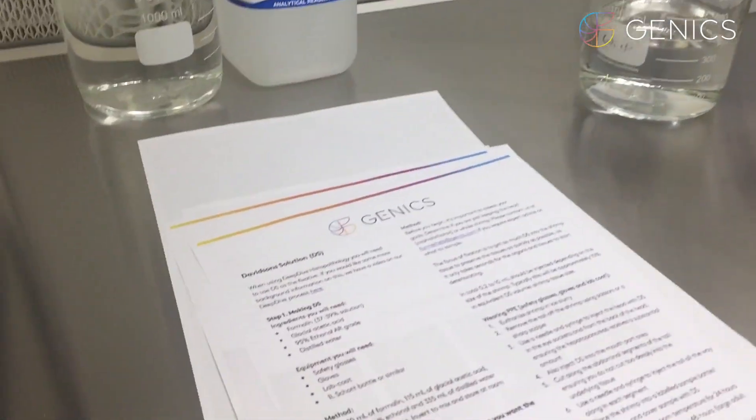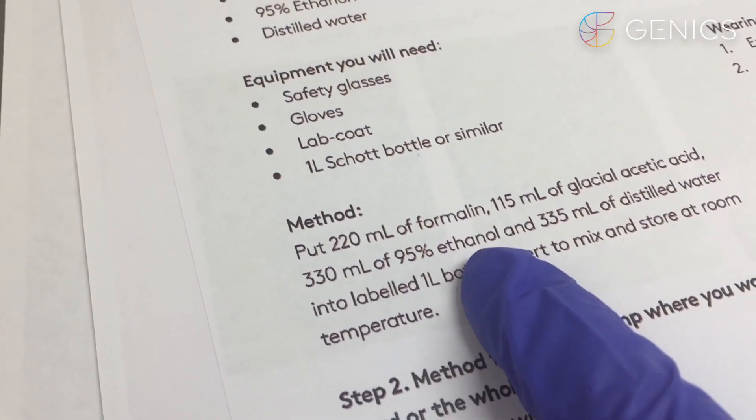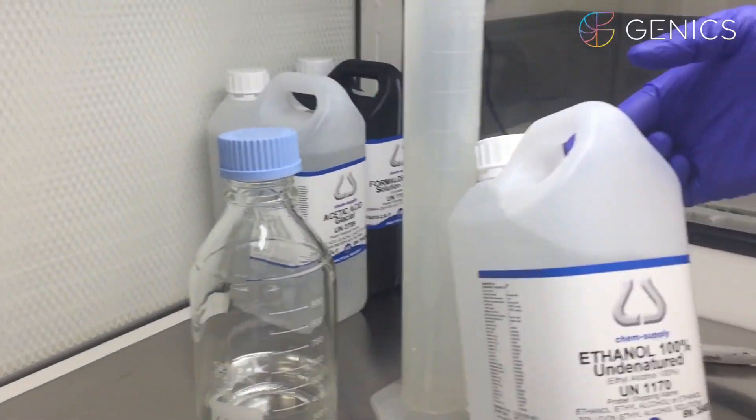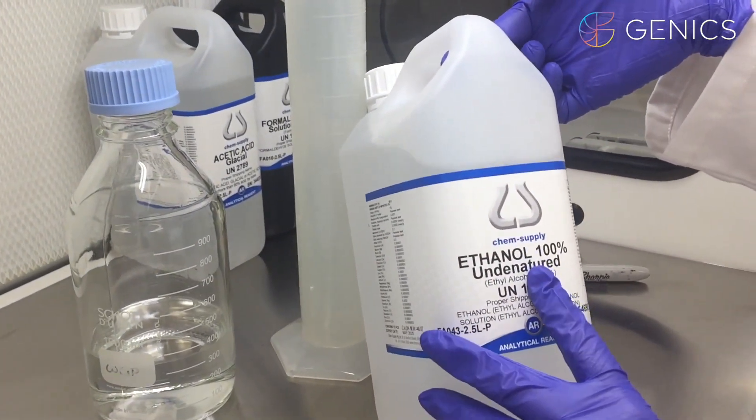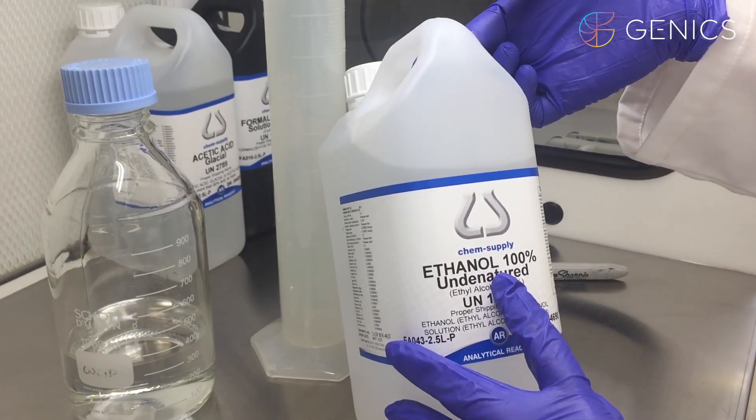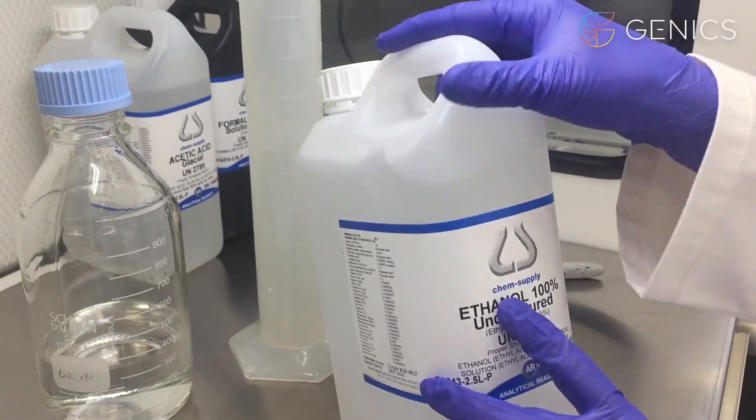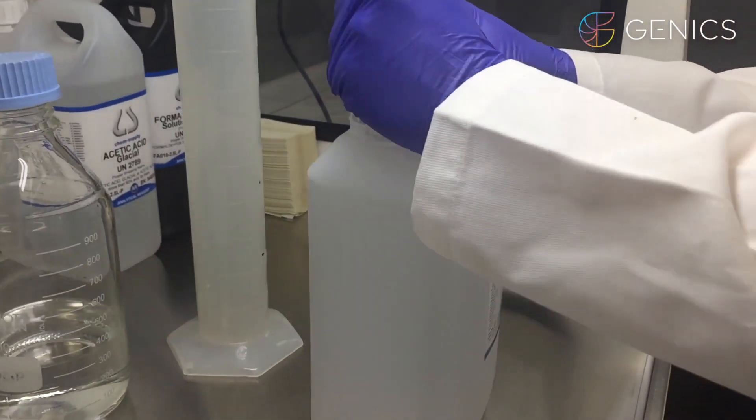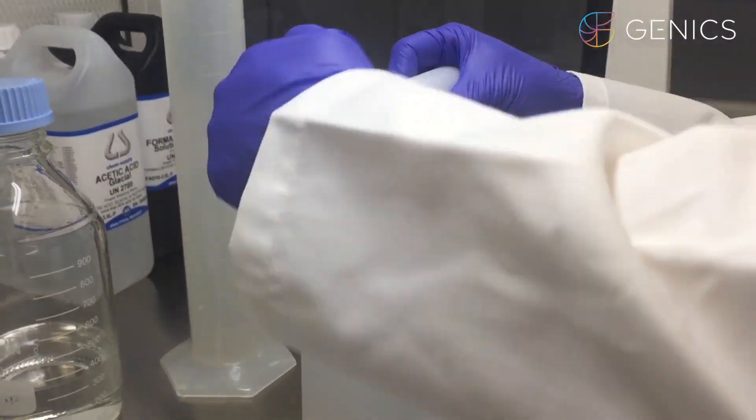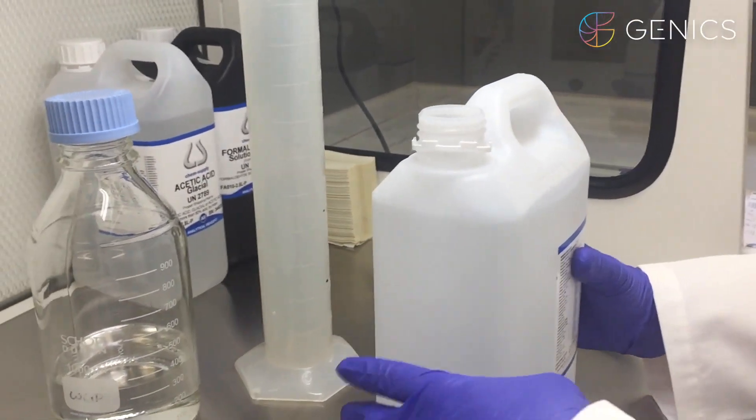Third, we put in 330ml of ethanol. It says 95% ethanol, here we have 100% ethanol, undenatured. As soon as we remove the lid from this ethanol, the moisture will drop the percentage down to about 95%, 97%, so it's okay to use the 100% ethanol, 330ml. We'll mark here again.